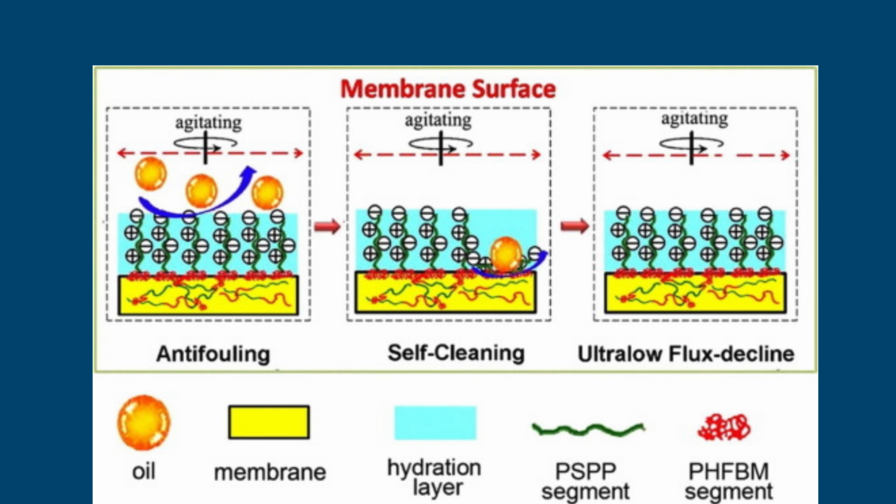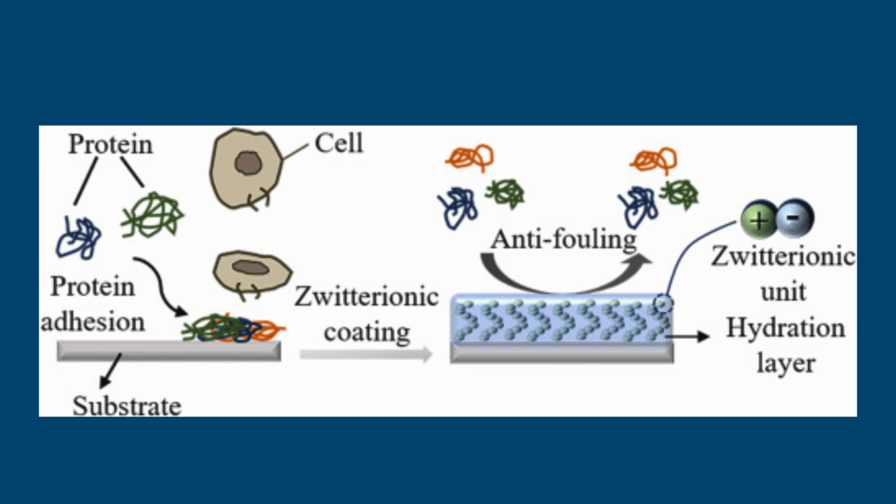fouling. Modern membrane engineering strategies have significantly improved fouling resistance through surface modification techniques, hydrophilic coatings, zwitterionic surface chemistries, and low-binding membrane materials. In addition, optimized flow channel geometries and automated process control systems help maintain favorable hydrodynamic conditions that reduce fouling and extend membrane lifespan.